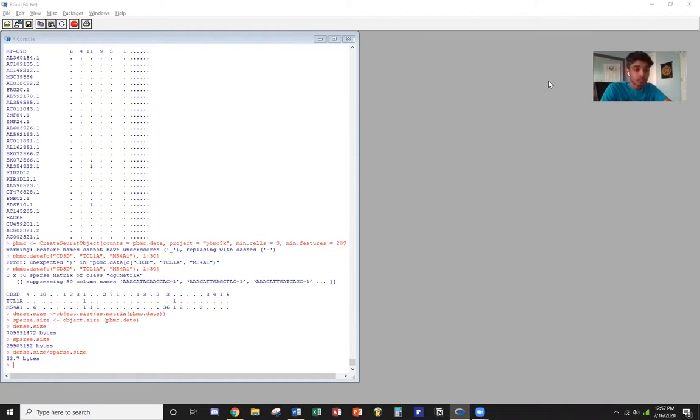So now we'll be stashing the quality control statistics. This is a very essential part in the Seurat method. So PBMC.